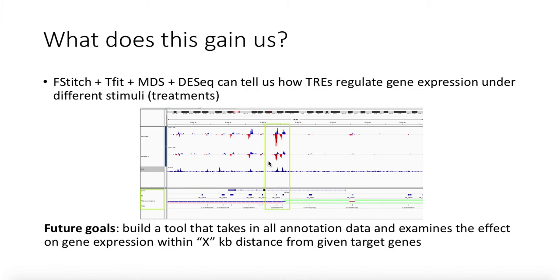a lot of this stuff is on. If we zoom in, we see a lot more transcription over this entire region. And then you can also see in the bottom here an example of MDS output, right? So it's saying there's a motif here and here that also nicely co-localize with these strong bidirectionals, ChIP peaks, and Tfit calls. So pretty cool example of all these tools working together.